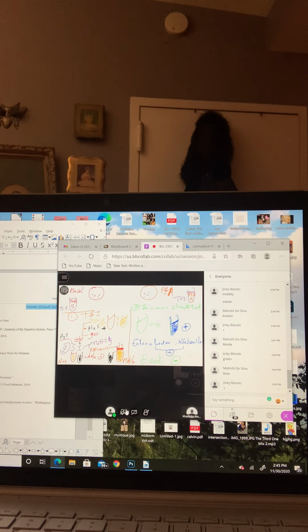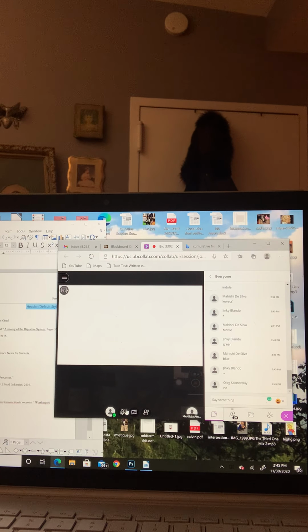Any question? No. So we talk now about the fourth test, the MRVP test. The MRVP is part of the IMViC test.